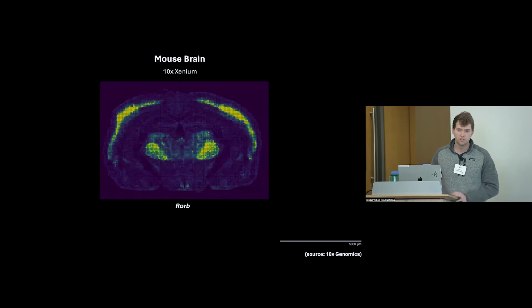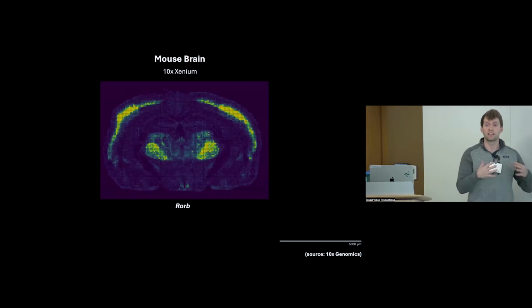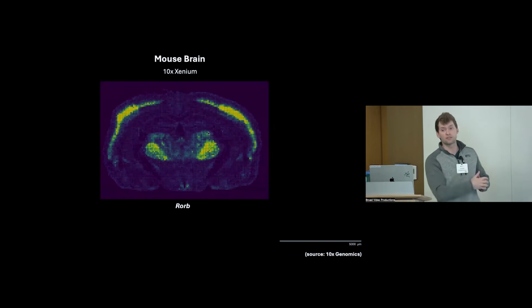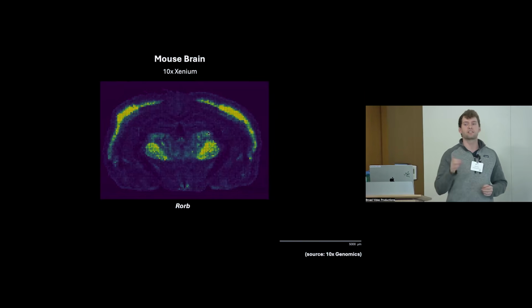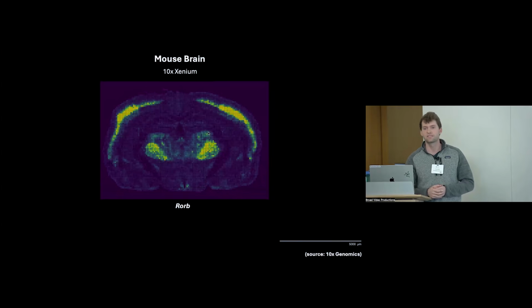One question is, other than the visualization purpose, what is the benefit of putting them into the grid? That's a great question. I think I'll answer it briefly. I think there's a computational benefit. So we're reducing the single cell data, which is a ton of data, to these patches, which reduces the data. So it's a little easier computationally down the line to run things. It won't take as long. But hopefully, Dr. Fan will be talking about that a lot more in her talk, and she'll give you a better answer of why we do it and other reasons.